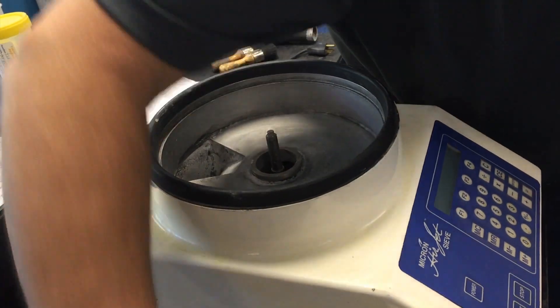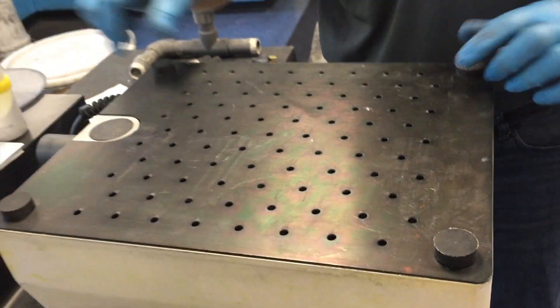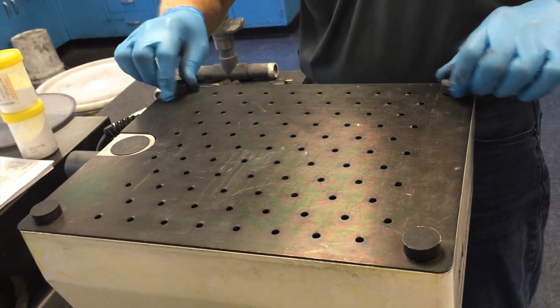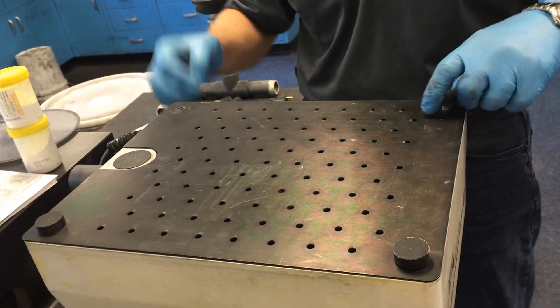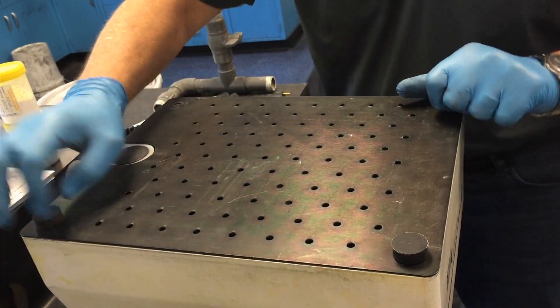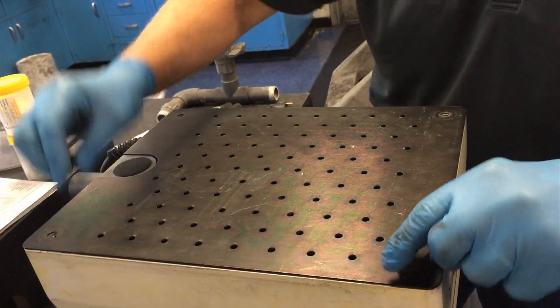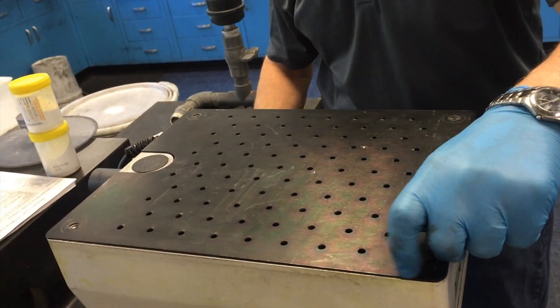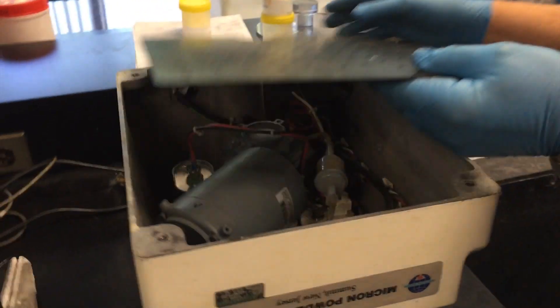Next, we're going to remove the wand, because what's going to happen is we're going to rotate the machine completely upside down, and then we're going to unthread the mounting feet. Once all four mounting feet have been removed, the bottom plate can also be removed and set aside.